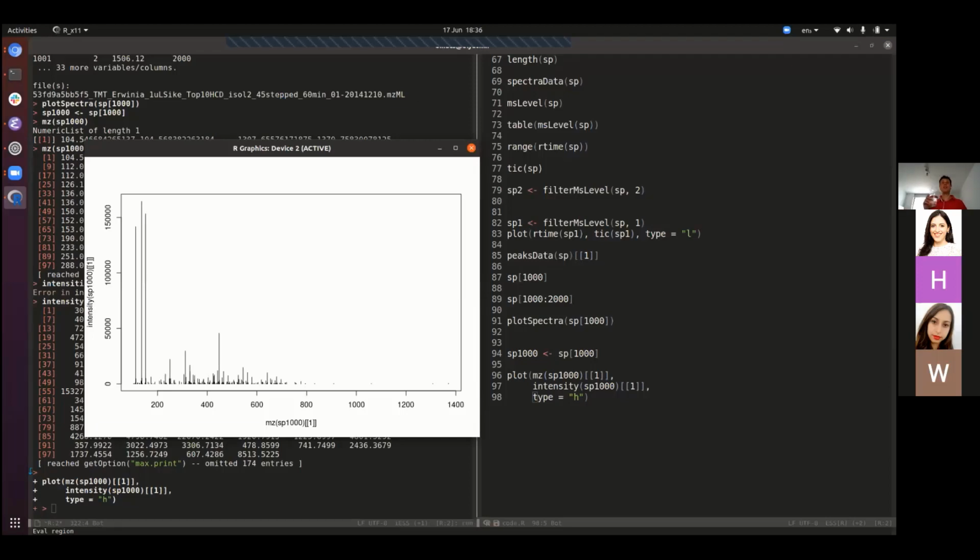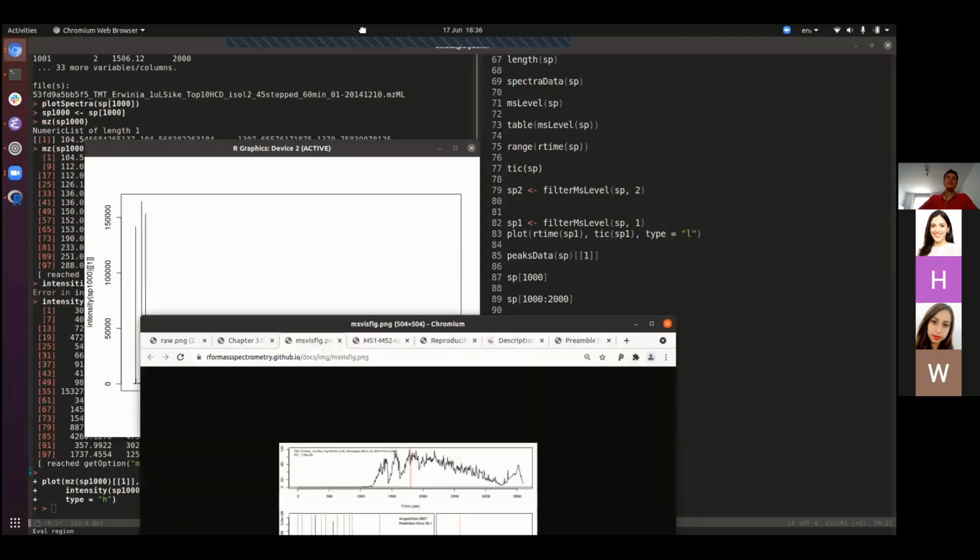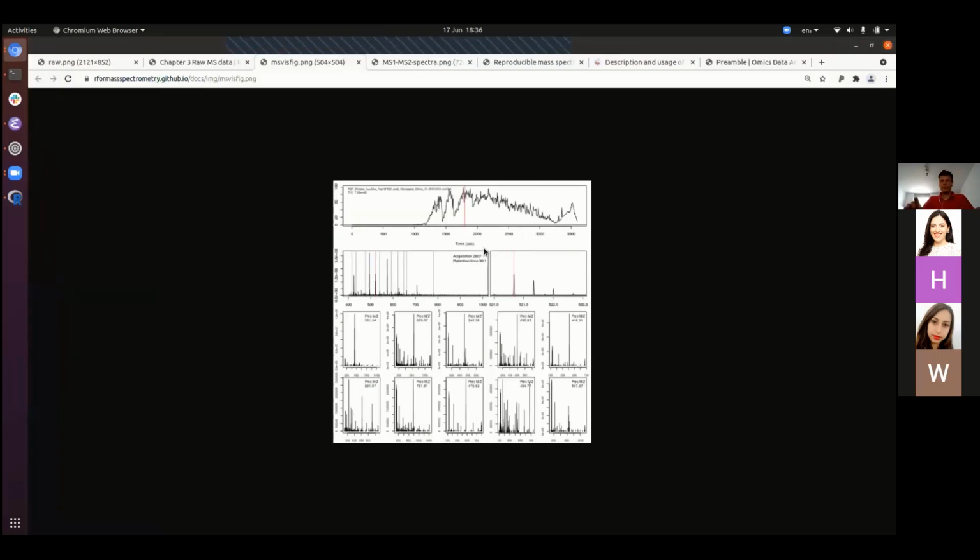Are there any questions? Because otherwise, what I would like to do now would be to produce this image with you.